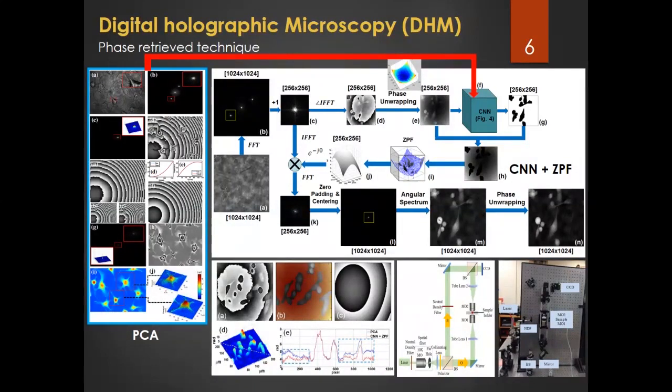Here, we introduce another technique, auto segmentation based on deep learning. First, the image is captured from the previous setup, put through the Fourier transform, and we get the phase out. This is the phase aberration you see, which is similar to the result before. Here, we apply a convolutional neural network to segment out where the sample is and where the background is. From that, we apply fitting to get the phase aberration and subtract it from the original phase image, and get a very nice result for the blank background and the sample.